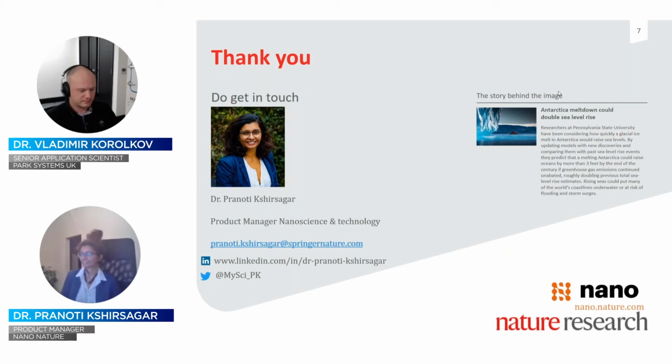Thanks. Great, thank you, Pranoti. We've got another question here for Vladimir. It comes in from Joyce. Hi, Vladimir. Thanks for the great presentation. Could you tell us more about the sample preparation for the AFM characterization?